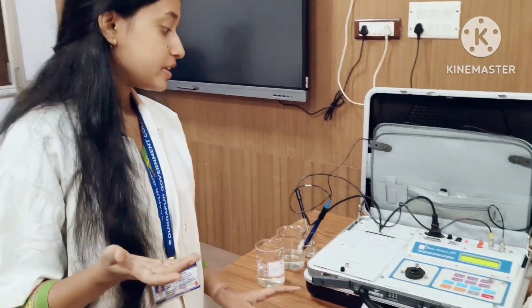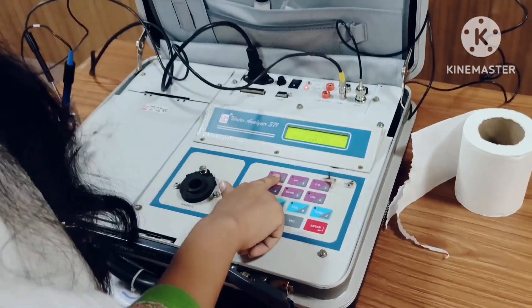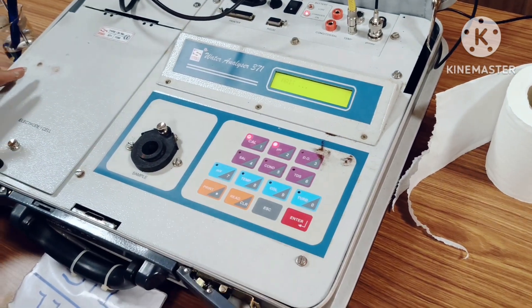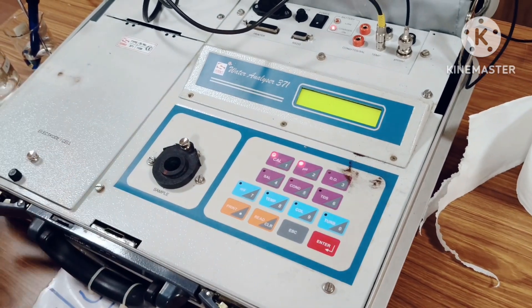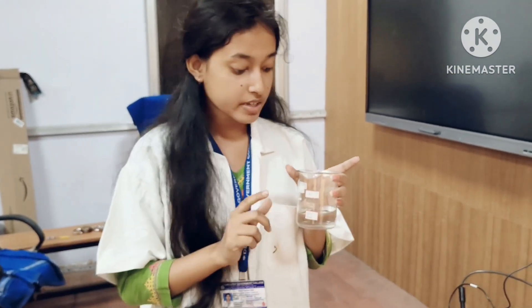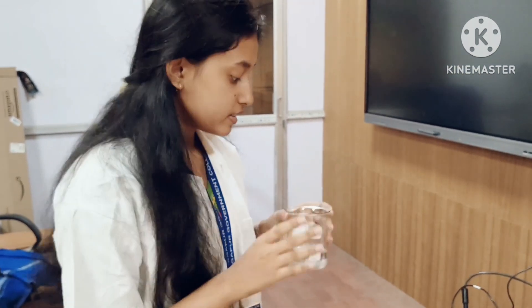To calibrate the pH electrode, first we have to press the calibration button, then pH, then enter, and wait for a second. Meanwhile, let's take a look at how we make the pH 7 solution — we take 100 ml of water and a pH 7 tablet, then dissolve it. That's it.